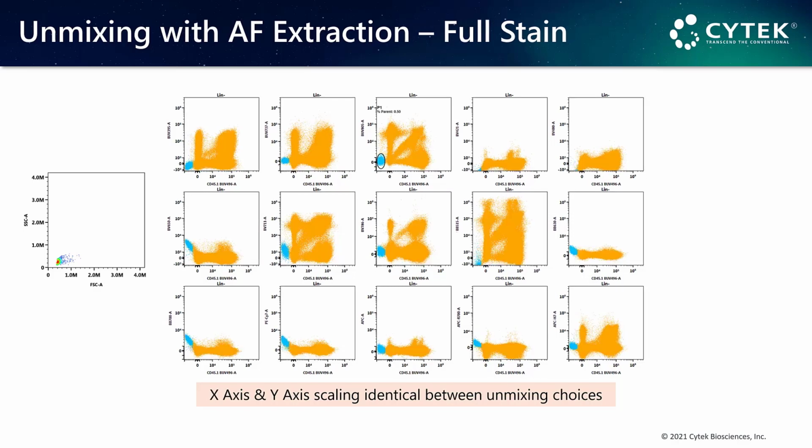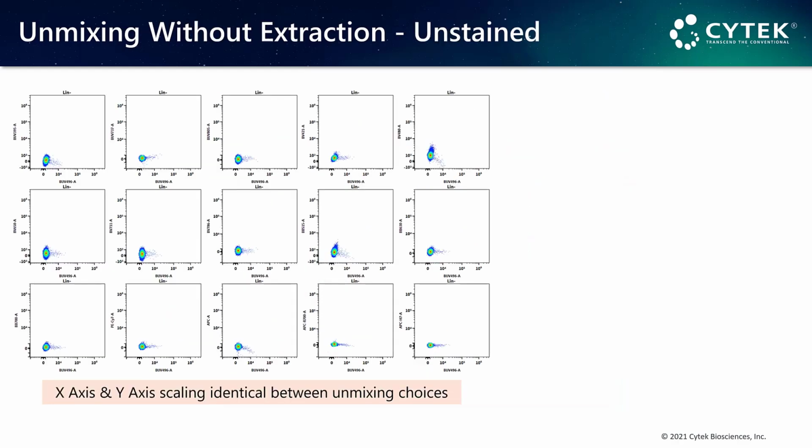When we backgate these cells, we see that the aberrant negative population tracks as the negative across all the plots. And this population represents approximately 0.5% of the sample, and based on its scatter profile is very likely to be cells that are dying during the sample staining procedure. Ordinarily, when we are staining with a fixable viability dye, we stain at the beginning of the assay. And this means that any cells that die during the assay will be negative for that viability dye, and as a result, they're not going to be excluded by the viability gate, which I've already applied to this data set.